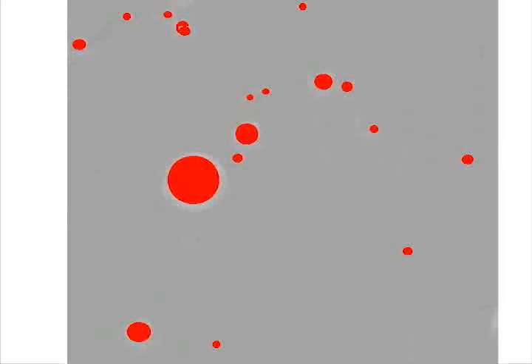Currently, the regions resulting from our segmentation can be used to count and estimate vesicle sizes only. However, the biologists are also interested in detecting non-spherical shapes.